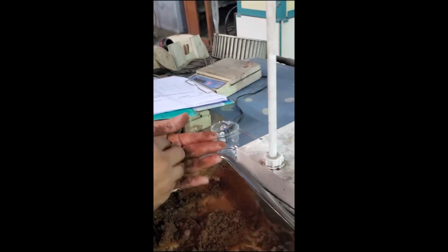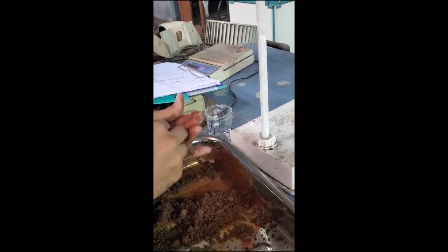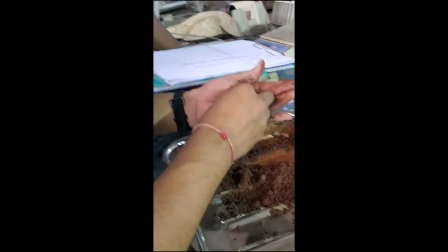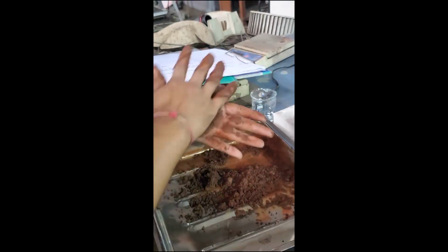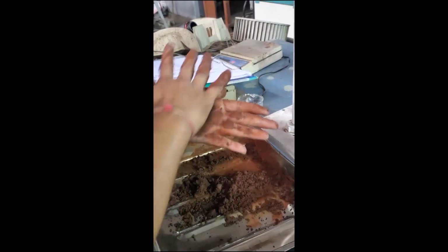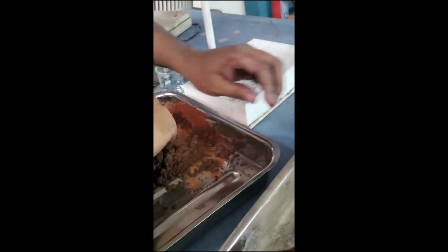Now we are making the pellet of this iron ore and water. So binder is not there. We added water into the iron ore and we are trying to make the pellet. So like this we can make the round pellets. So we'll keep them in the same tray so that they will not mix.